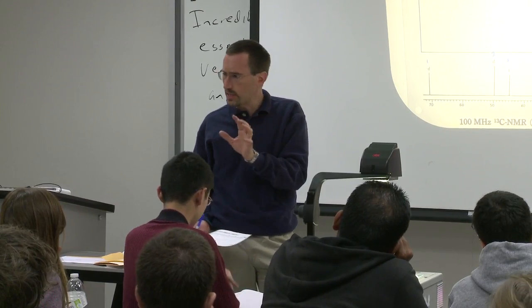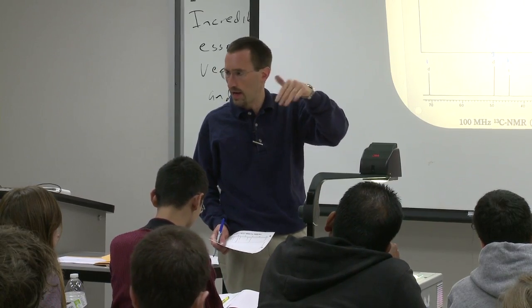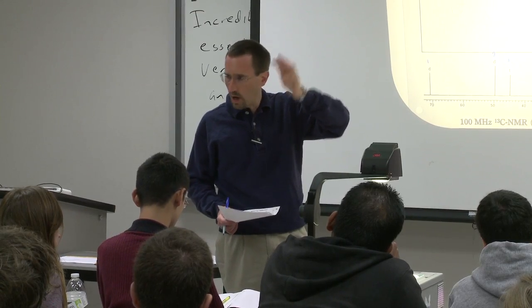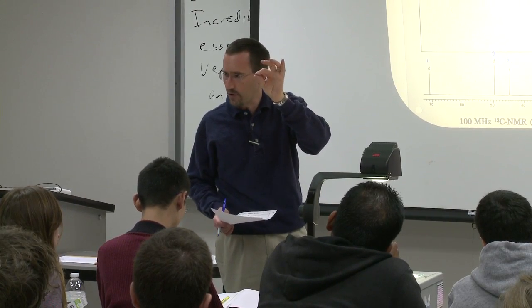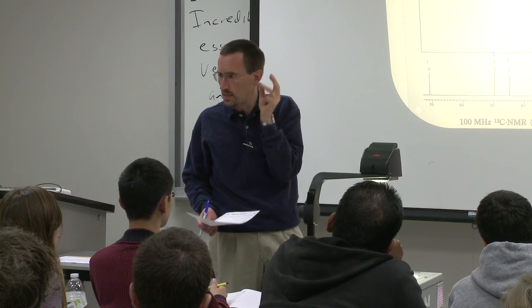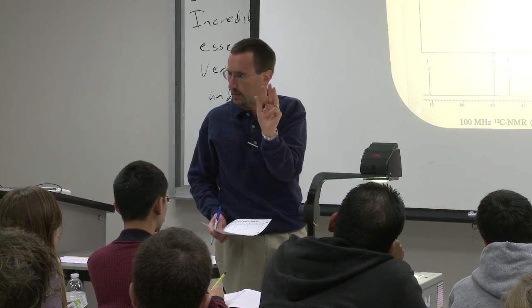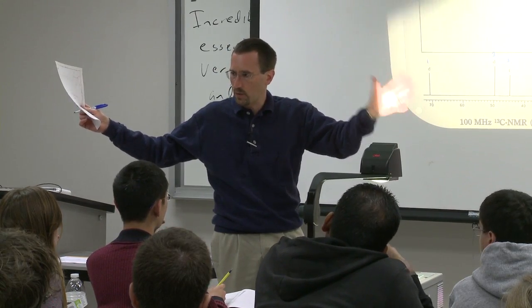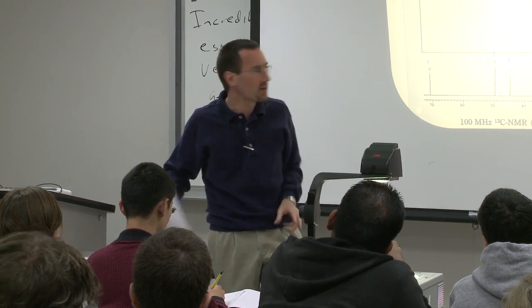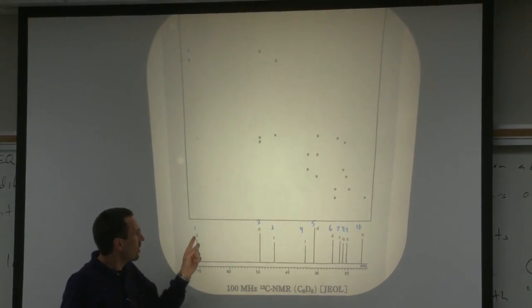In the off-resonance decoupling technique, you're partially decoupling. You're applying proton energy to flip the spins of the protons, but you're not doing so at the exact right frequency. So you're doing so slowly. So your multiplets collapse down, and you don't see your 2 and 3 bond couplings, and you see just your 1 bond coupling. And instead of having like a quartet spread out with the lines 125 hertz apart, they're just like 10 hertz apart. Anyway, that older notation, which isn't used anymore, has stuck around.